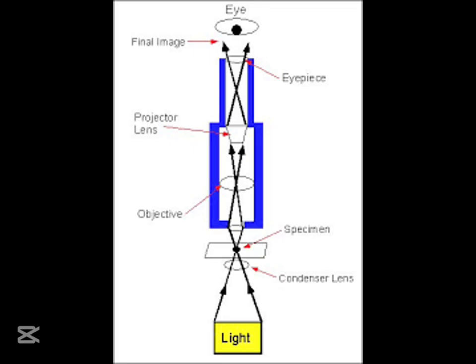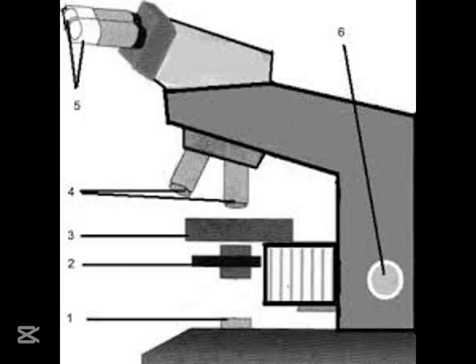So now that we've covered all the parts, let's talk about how to actually use a microscope. Sounds good. It's important to be careful so you don't accidentally break anything. Right. Always start with the stage all the way down. Got it. That way you won't bump the slide into the lens. Makes sense. And then you carefully place your slide on the stage and secure it with the stage clips. The tiny seatbelts. Exactly. Make sure it's centered over the light.